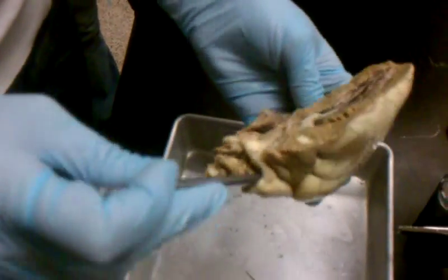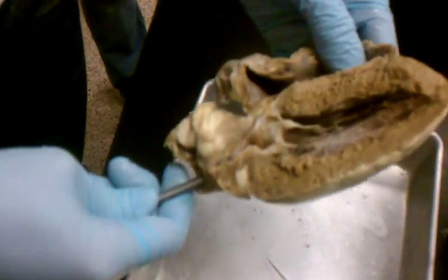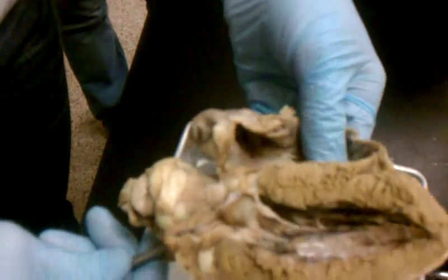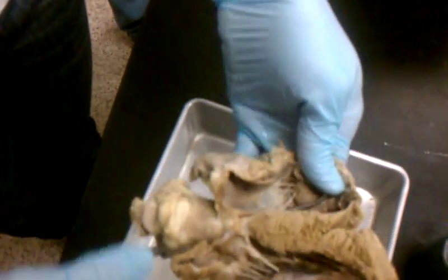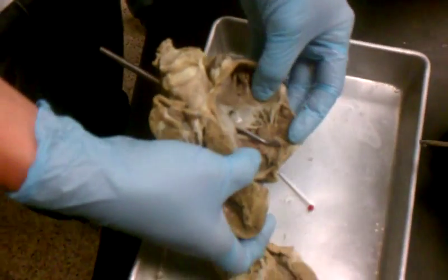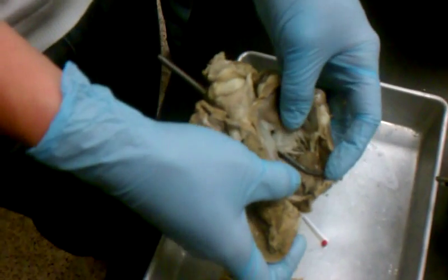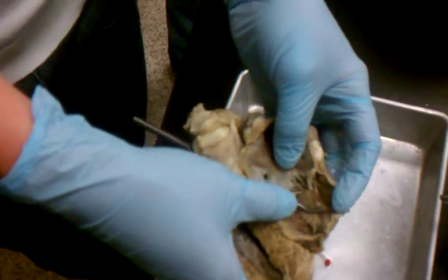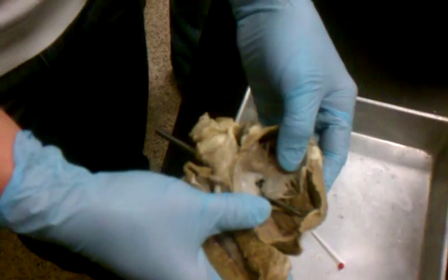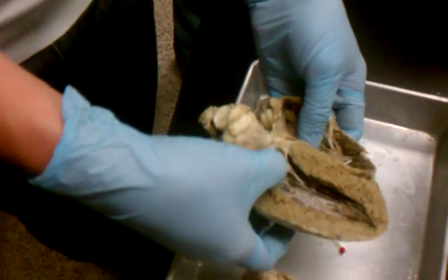Okay, so this right here is your pulmonary trunk, and I just kind of tried to feed the probe through, and it does go through. So right there, what valve would that be? Pulmonic valve, that's what the book calls it, or pulmonic semilunar valve. So if your TA talks about semilunar valve, it's either this one, pulmonic, or this one, aortic.